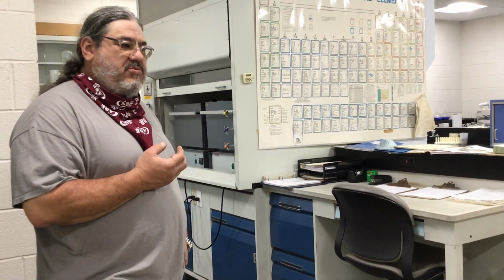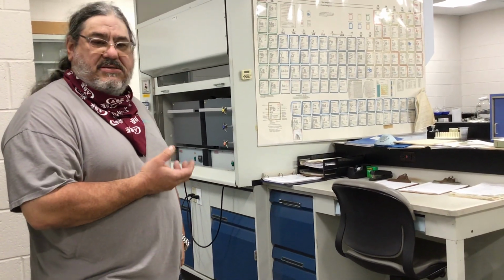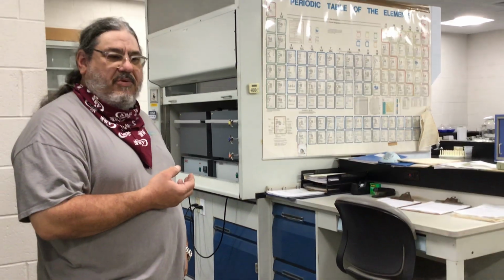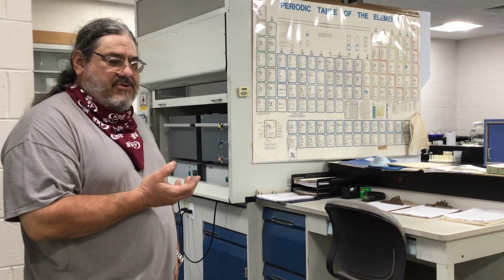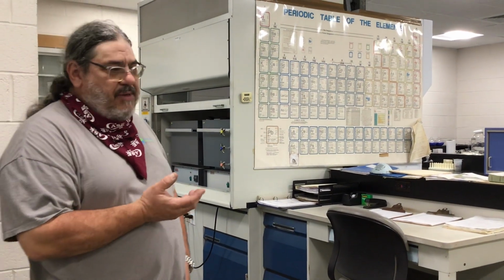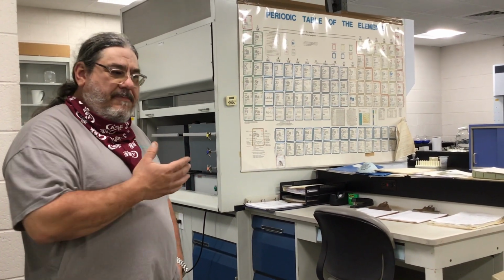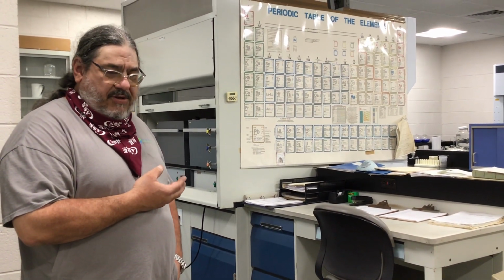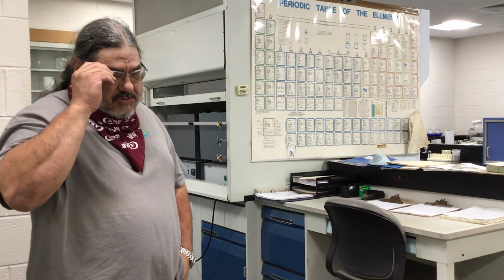So what we're doing is we're looking to protect the biology of the process. We're looking to protect or maintain the sludge quality so it doesn't become contaminated with, say, some sort of heavy metal. And we also want to prevent anything that's called pass-through. Pass-through, an example of that would be if we received a slug load of, let's say, copper maybe, that would overwhelm our system, and actually part of it would go out in our effluent. And our concern with pass-through there is the biology in the river, that we do not want to disturb any or create any problems with toxicity in the Susquehanna River.